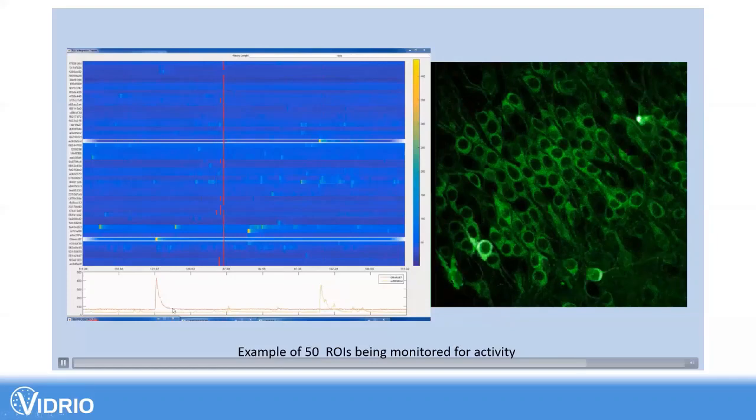You can then also set up trigger events that would occur based on activity of your region of interest. So I think there's a lot of discussion about trying to do closed loop stuff. And so John's going to now demo how you would set something like this up. And it's actually not that different.